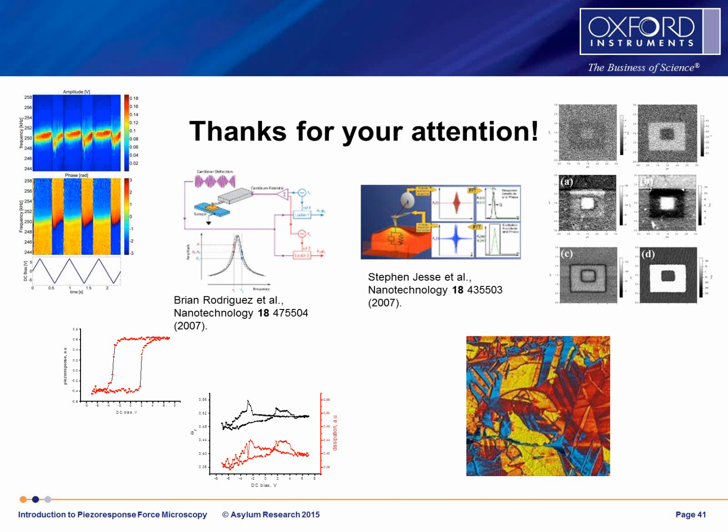You should have the substrate grounded or at a potential. In the case of some of the high voltage measurements, that does put some special constraints on it. And the other thing to be careful about with high voltage, of course, is safety. You should avoid putting body parts onto high voltage. You'll see a very strong electromechanical reaction in yourself. I think that's it.